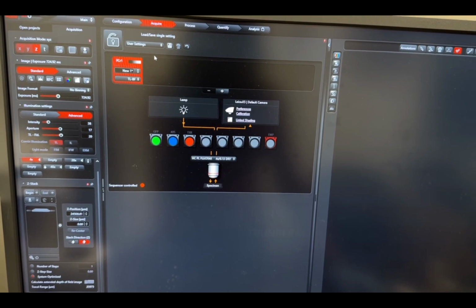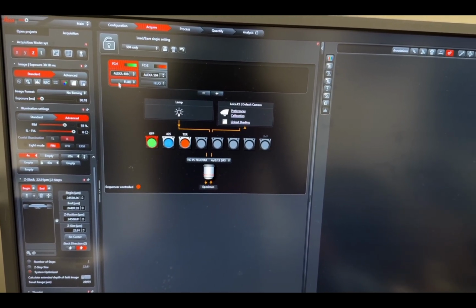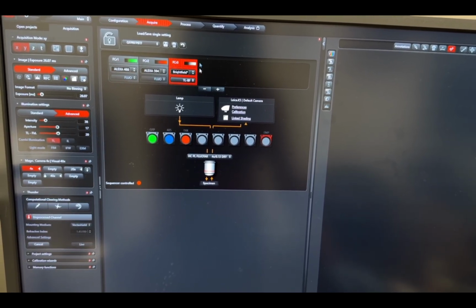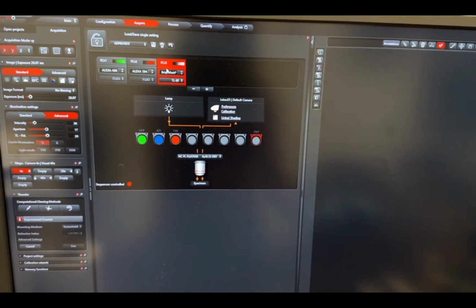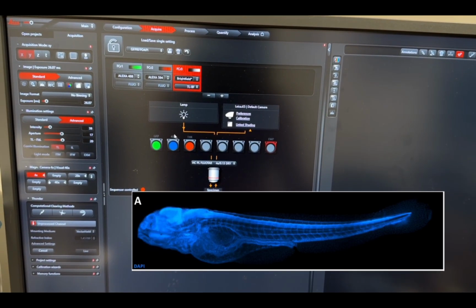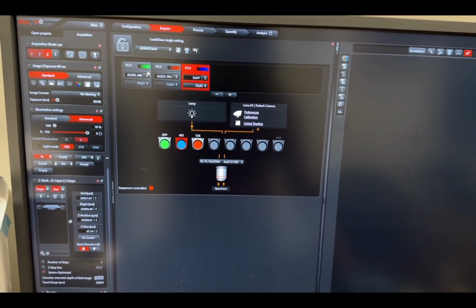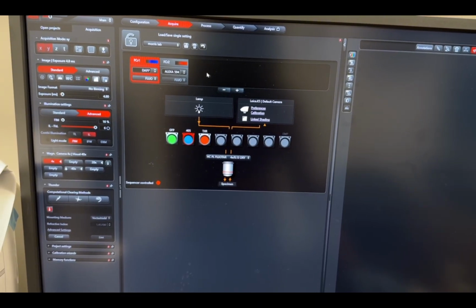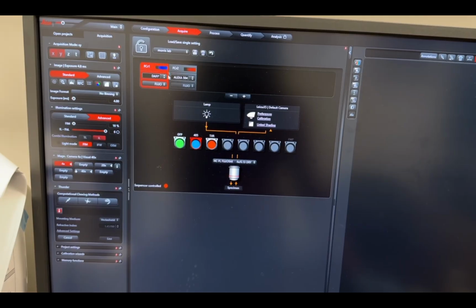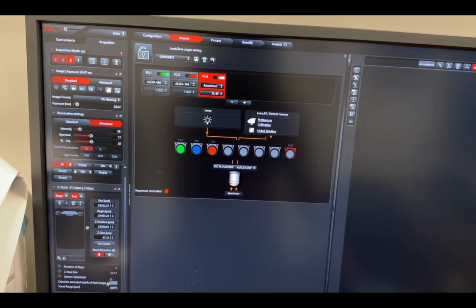You'll see that depending on the settings, let's say I click this one for example, we can have settings for both green and red fluorescing stains. If I do this one, we also get something called a bright field, which just shows you the tissue on its own under the microscope. We have one for DAPI. DAPI is one that shows under blue lighting. And then we have one called Morris Lab. Let's see what that one is. This is DAPI in the red. So lots of options. Typically for my projects, I tend to work with this one. But depending on your project, you might be using different settings.